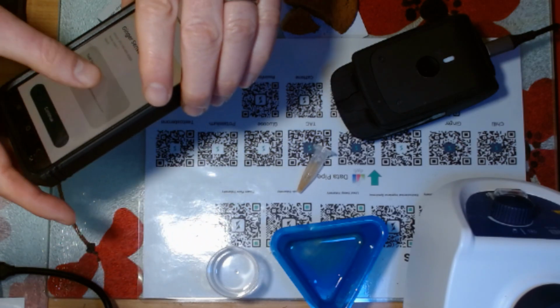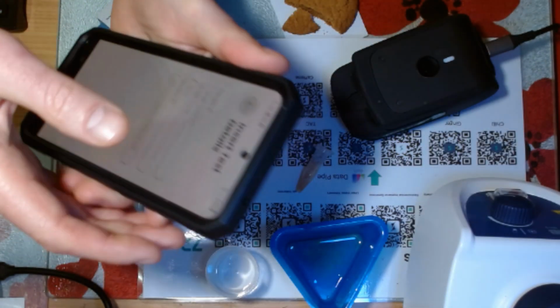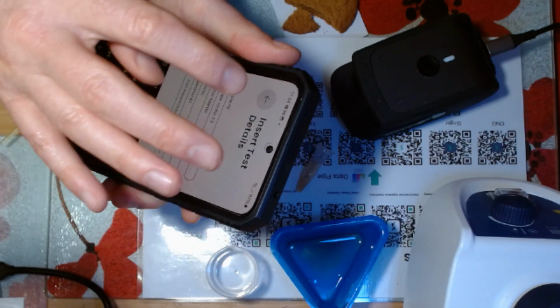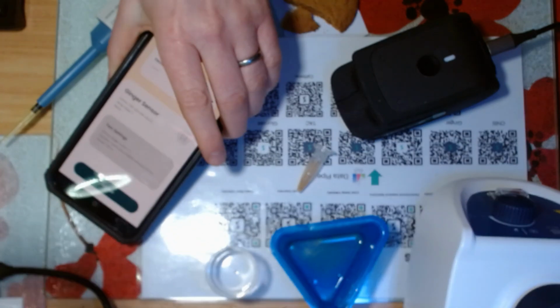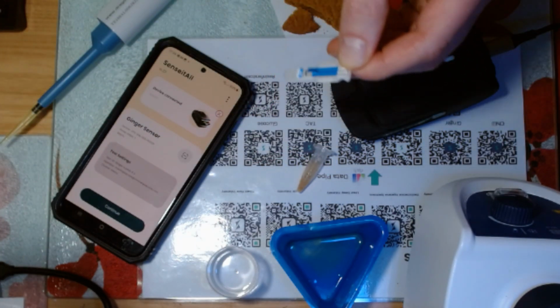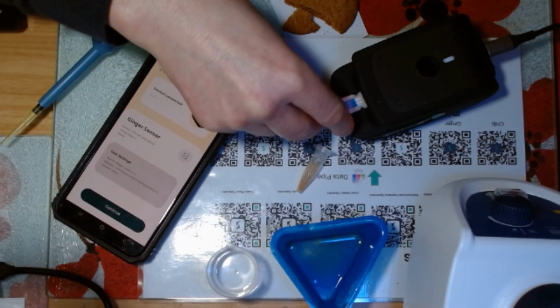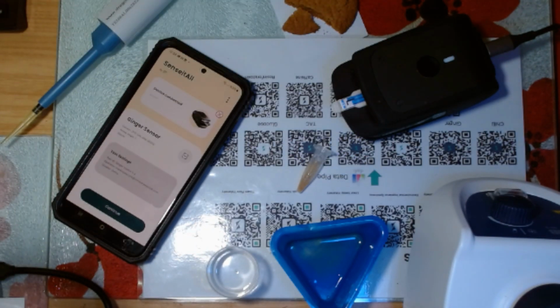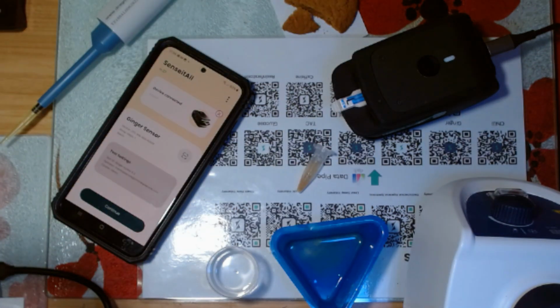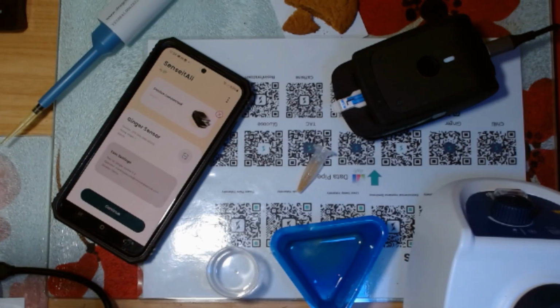What I'm going to do is name it on the app so I can find it. So I'll go ginger cookie. I'll do the 2. That'll help me identify the data. And I will get a fresh sensor, snap it off its carrier, put it into the instrument. I want to grab 50 microliters of that sample I've prepared.